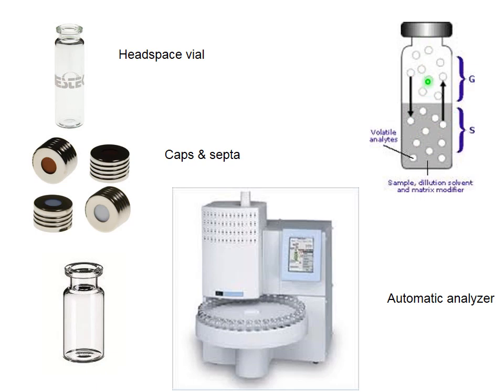After that, you insert the needle and take a sample of this gaseous phase into a syringe. This can be done automatically. This is an example of automatic headspace analyzer, a very common approach for many semi-volatile compounds.